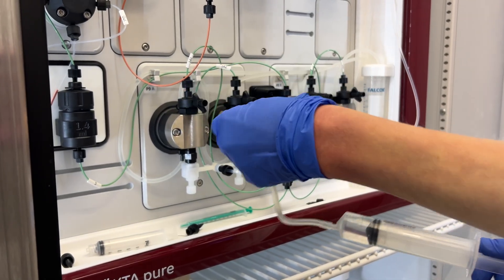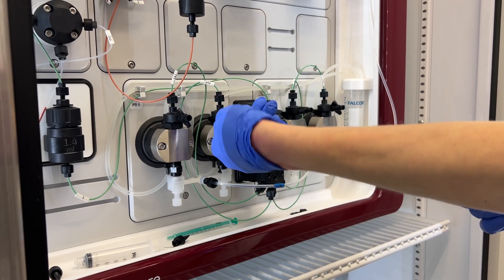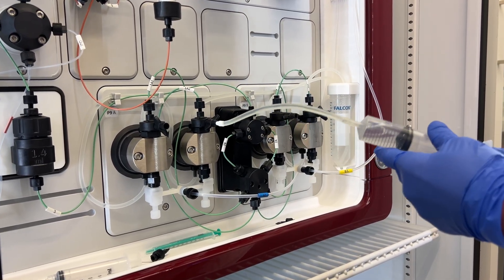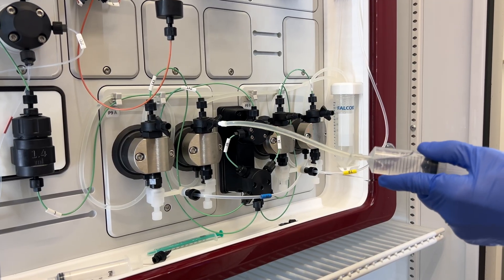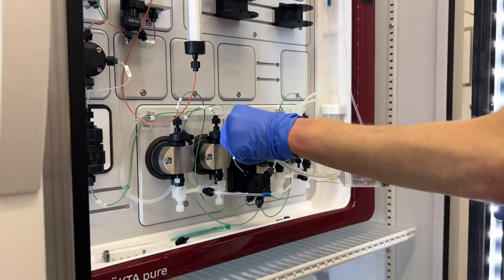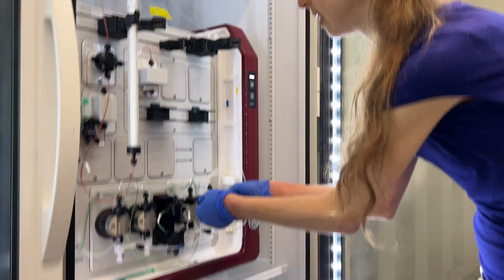You always want to do it with both heads — the right and the left head. You don't want to pull out too fast, just a nice flow. Then close it back up. You can do it either with the tubing or you can just go directly in with the syringe.